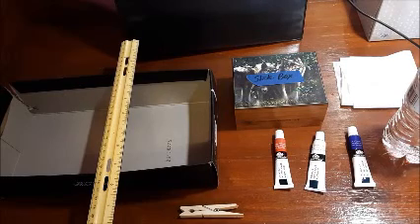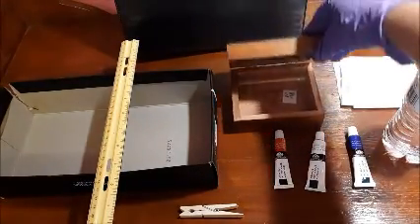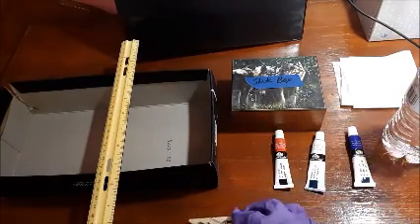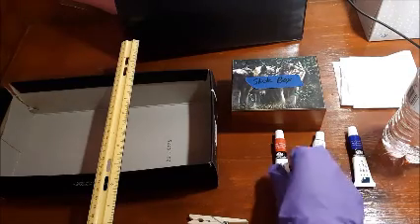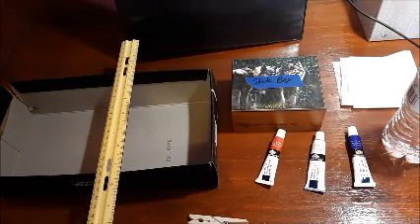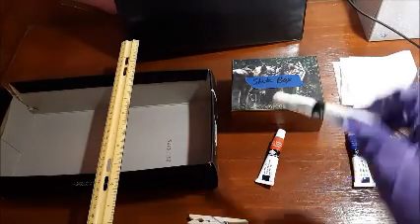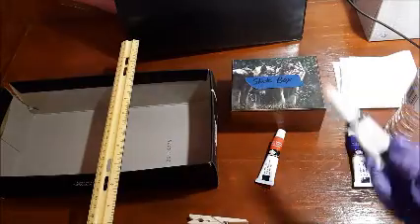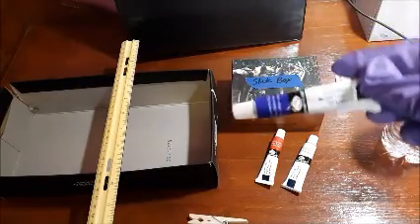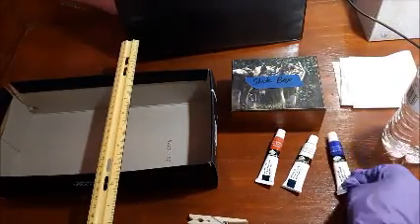Before you can start this experiment, you will need to gather some materials. These will include your heat fix slides, which are in this slide box right here. You will need your stain tray and a slide clip. You will also need carbol fuchsin stain. In this experiment, carbol fuchsin is your primary stain. It will stain any bacterial cells that are acid-fast. And then you have your acid alcohol, which will be your decolorizer. You will have methylene blue stain. This is your counter stain. It will stain the non-acid-fast bacterial cells.